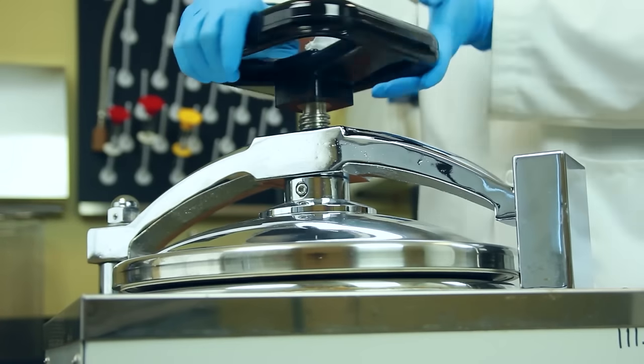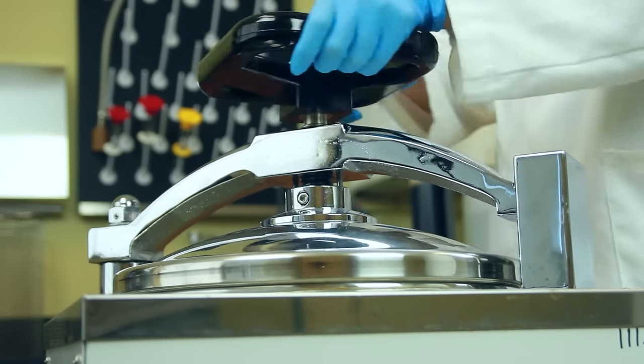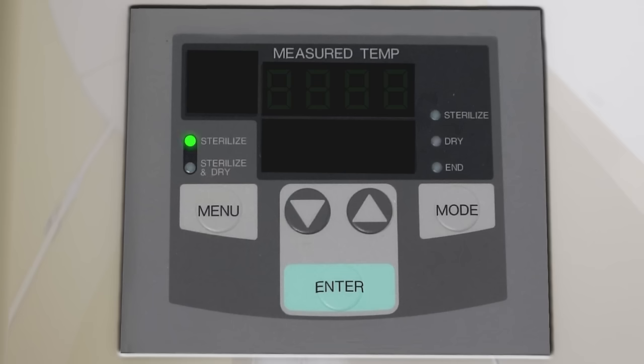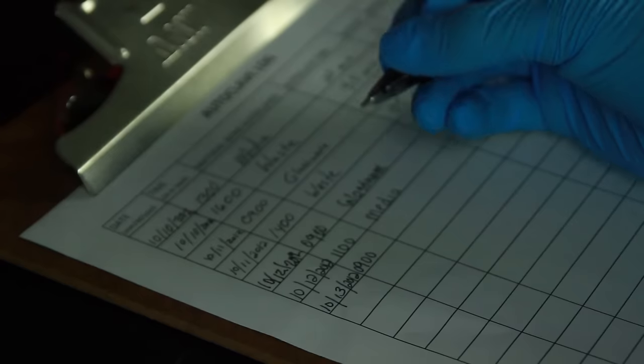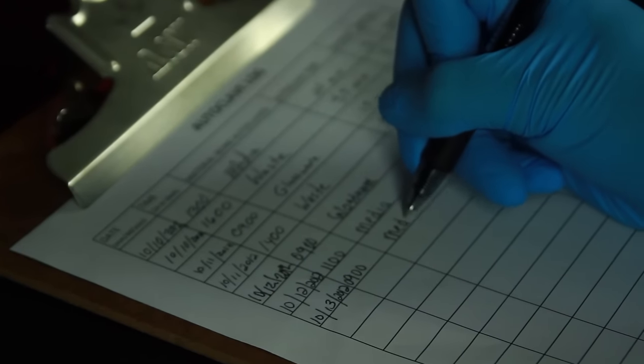close the lid, and turn the handle to create an airtight seal. Use the control panel to set the mode to sterilize. The temperature to 121 degrees Celsius will run this cycle for 17 minutes. While it's running, enter the date and time and the operation details in the log and initial.